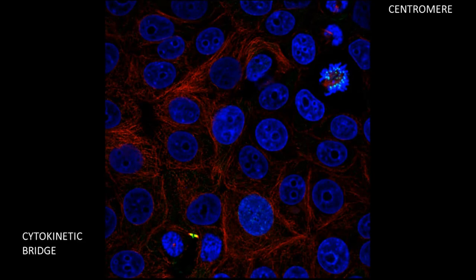And this image, I think, nicely illustrates the power of using an antibody-based and imaging-based approach to study proteins, because we can see that this protein has a very distinct localization to the centromeres in the mitotic cell up in the right corner, and then at the end of mitosis it redistributes to the cytokinetic bridge. So this protein is probably not expressed at a very high level, and it's only present in the cell at certain time points, and it has a very distinct location.